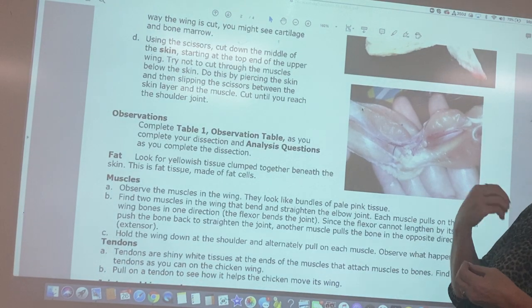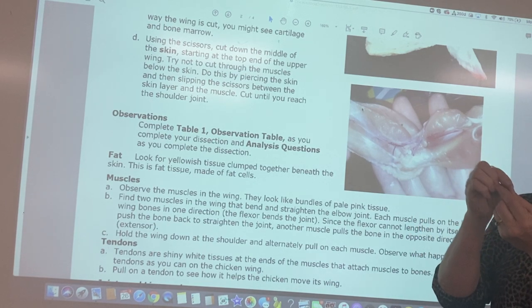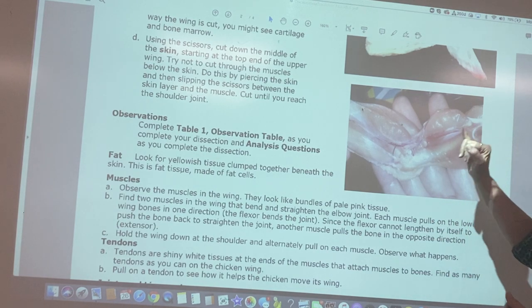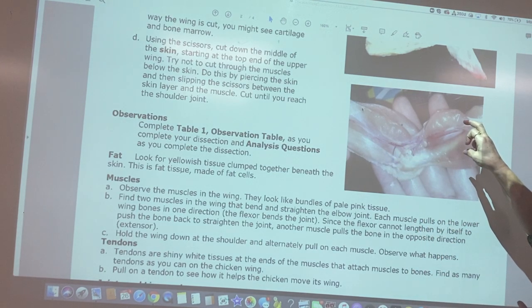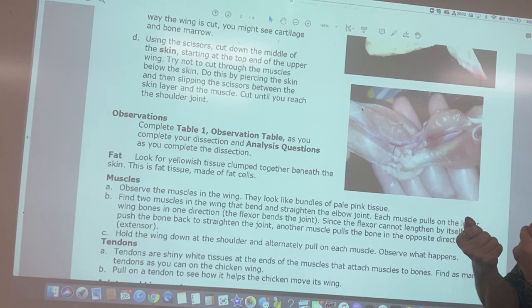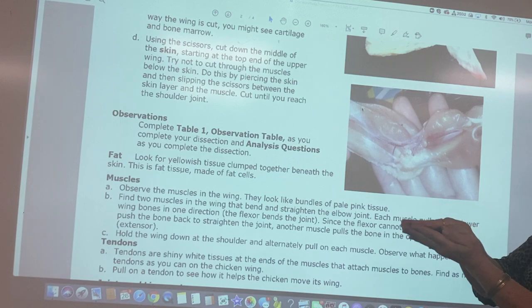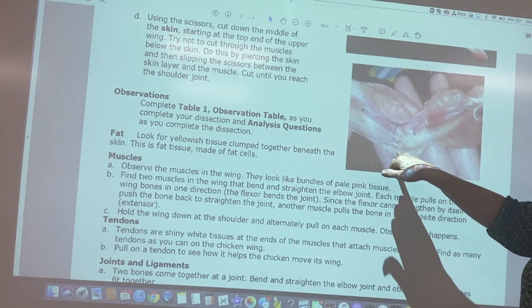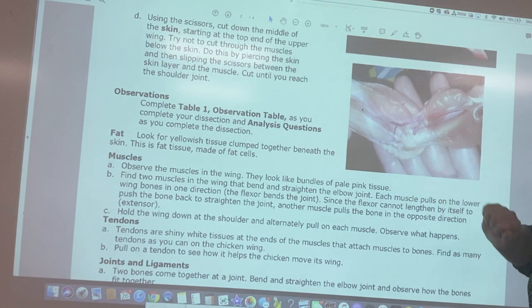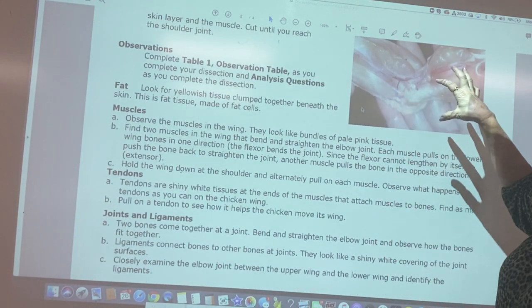When we start the lab, we'll begin by removing the integumentary system — the skin on the outside, which is bumpy with pores where feathers came out. We'll remove the skin down to the muscle. It's hard to remove because connective tissue holds everything together. Underneath the skin you might see chunks of fat, which will be a yellowish tissue.